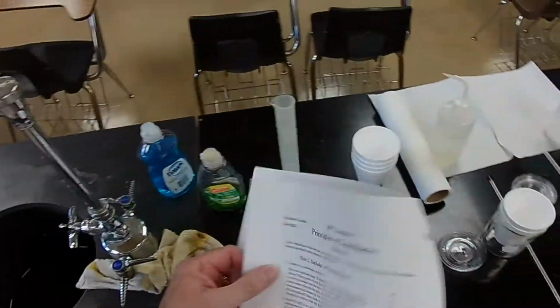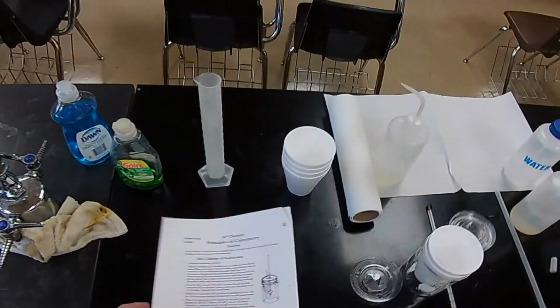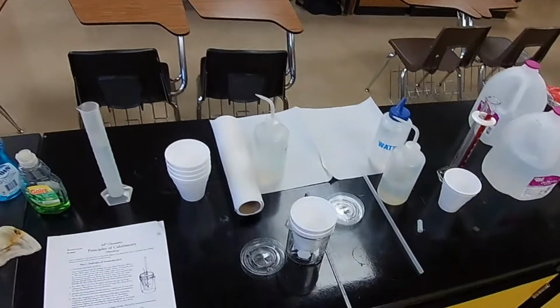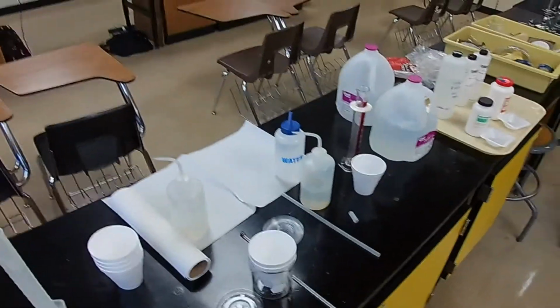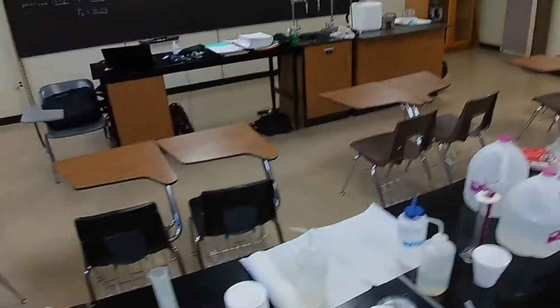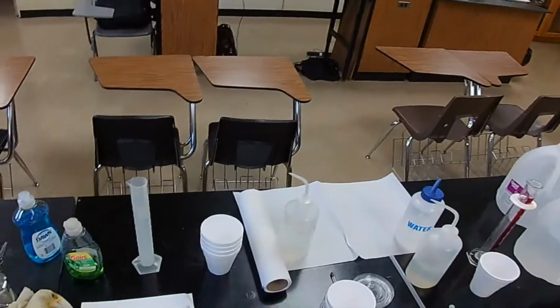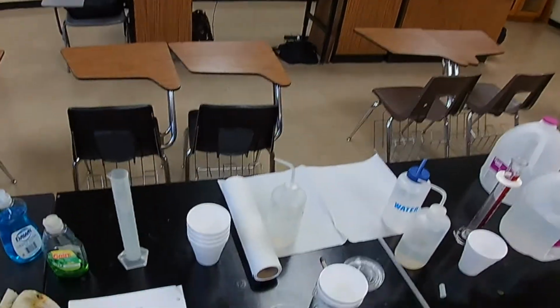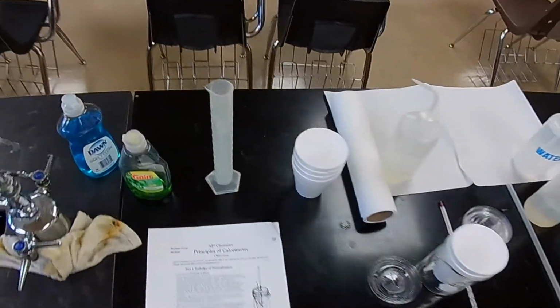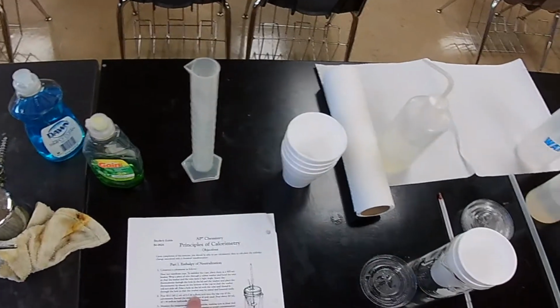Now, what's next? Part 1 in your experiments is the enthalpy of neutralization. That just means how much heat is evolved, and this is an exothermic reaction, how much heat is evolved in the process of neutralizing an acid with a base. All right? So our acid is going to be sulfuric acid.